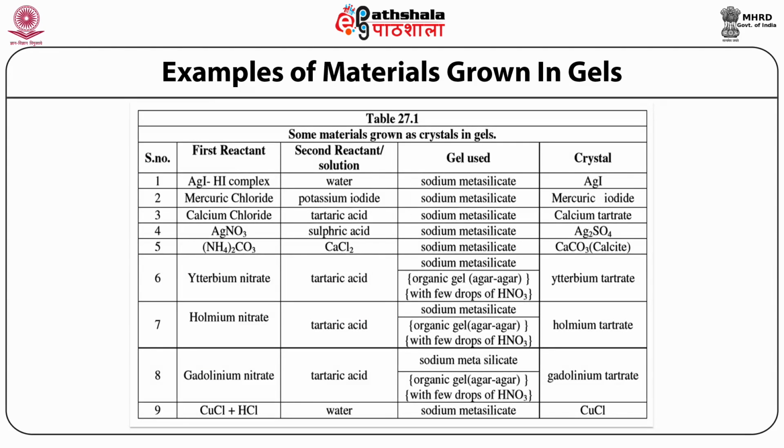Examples of materials grown in gels. A large number of crystals have been grown by using the gel method of crystal growth. The list is quite large. However, some typical examples may be cited here in the following table 27.1.